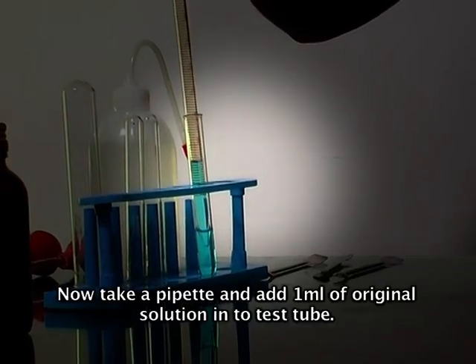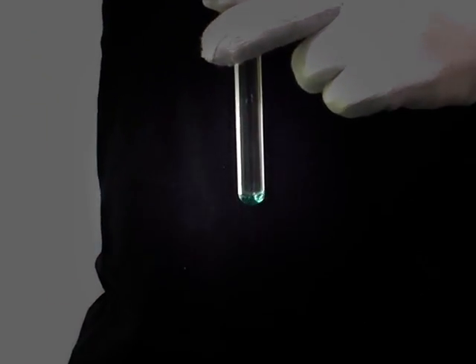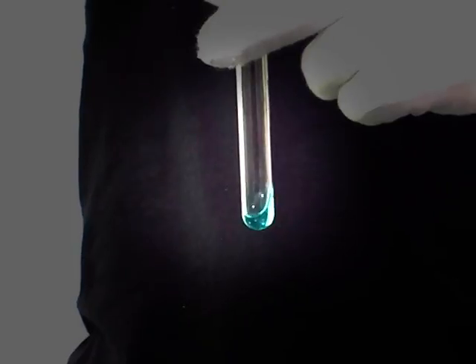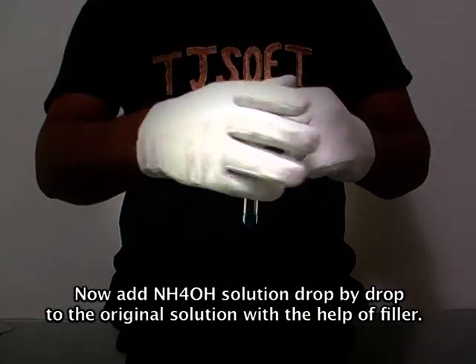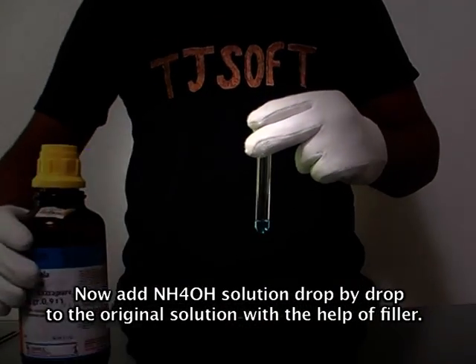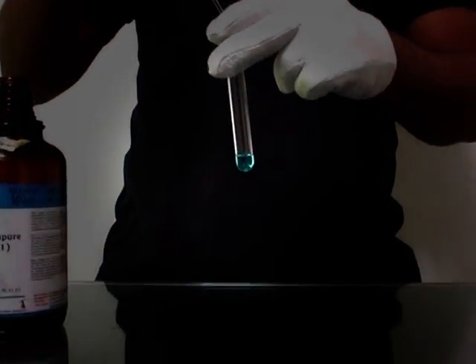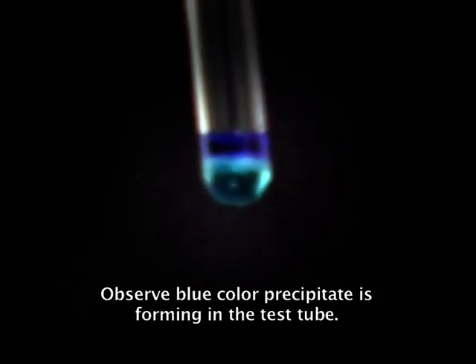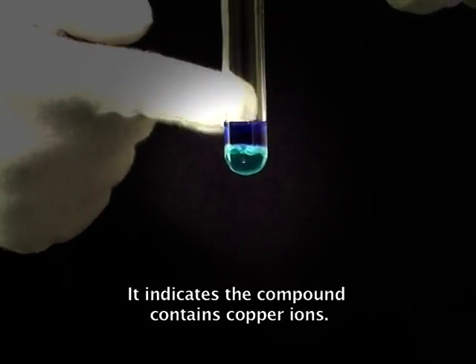Take a pipette and add 1 ml of original solution into a test tube. Add NH4OH solution drop by drop to the original solution with the help of a filler. Observe here — a blue color precipitate is forming in the test tube. It indicates the compound contains copper ions.